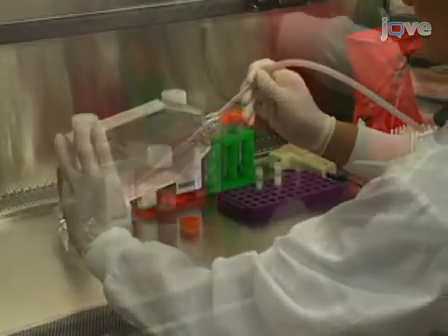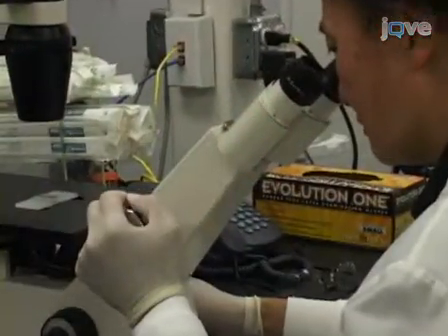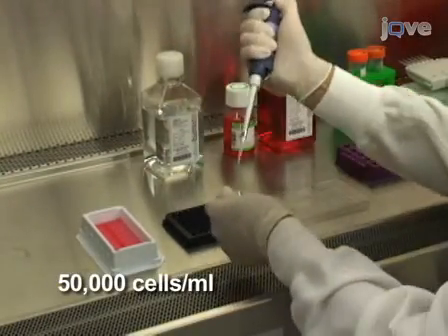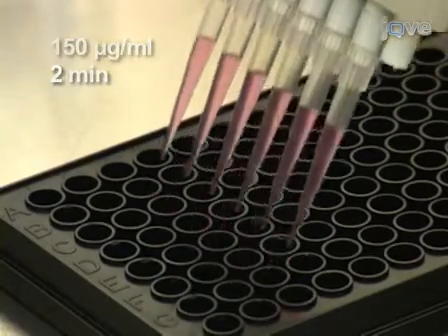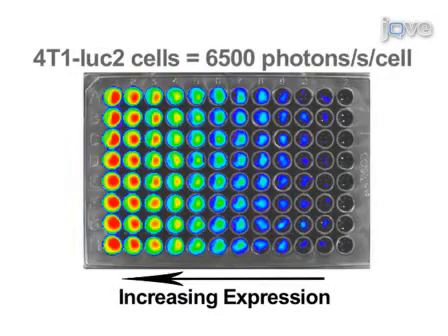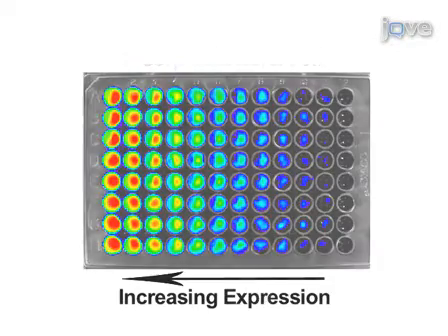Luciferase activity must be verified before injection. A 90% confluent flask is harvested by trypsinization and then counted. 50,000 cells are then dispensed in a single well of a microtiter plate and serial dilutions are performed. Luciferin is added to the wells at 150 micrograms per milliliter and incubated for 2 minutes. The microplate can be imaged in IVIS or a luminescent plate reader to determine expression levels. This cell line expresses up to 6,500 photons per second per cell, but any expression level above 30 photons per second per cell can be imaged successfully in vivo.